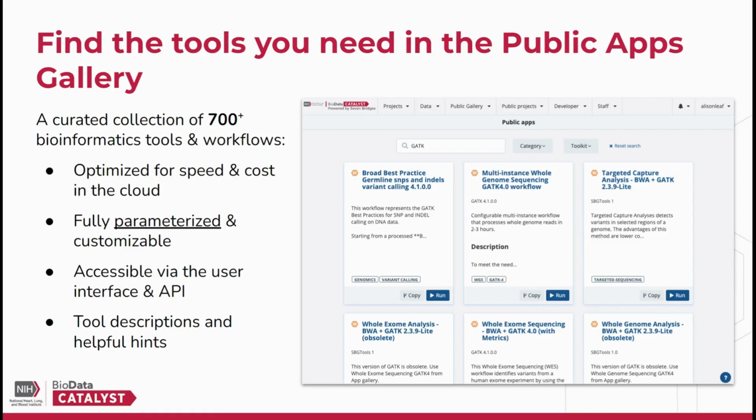You can find the tools you need in the Public Apps Gallery. It's a curated gallery and contains the tools for a variety of analyses. There's over 700 tools and workflows. The benefit of using the apps gallery and the apps that are contained in it is that they've been optimized for speed and cost in the cloud.